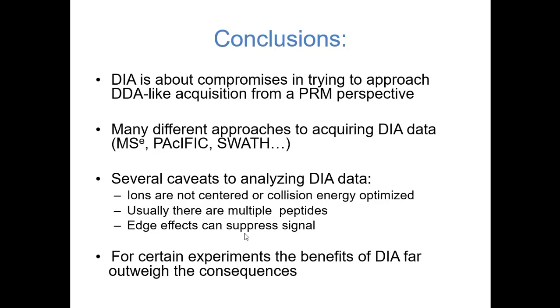It still makes a difference, right? If you are searching for a peptide during the entire gradient, it can be 25 minutes, or if you have to do it in 5 minutes, it increases your chances to pick the right one by fivefold at least.